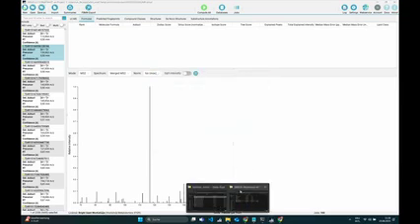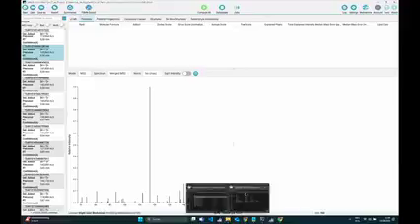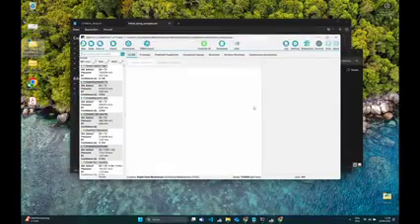But now let's load in this pre-computed project space. We just drag and drop it into the window. Okay, this was not the thing I wanted. Okay, like this. So we have to drop it into the feature bar, but you can also just click on the Open button and then just select the .sirius file manually. So again, we now just imported this tomato_small.sirius file, and we want to open it in this window. So we don't want to make a new window, and this will take a little bit of time, but it will be really quick.